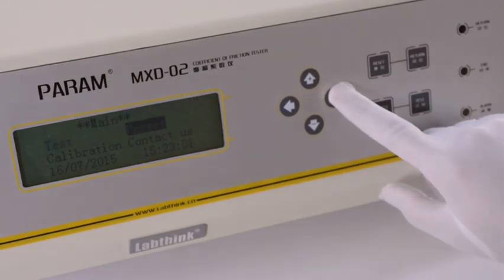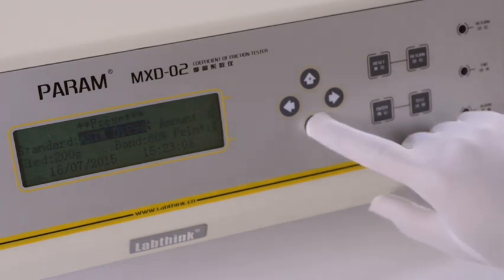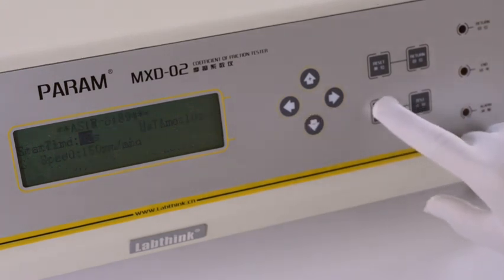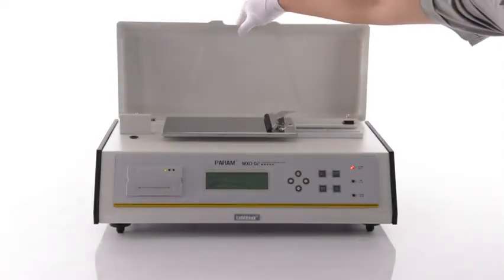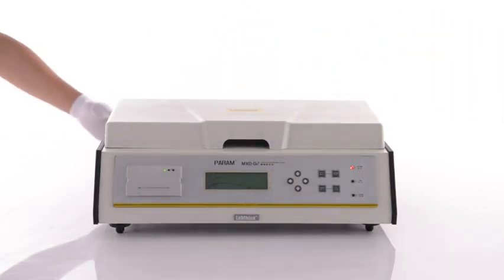Press Enter to enter the preset interface, and press the left and right arrow keys to move the cursor to standard, and select ASTM-D1894. The speed will be 150 mm per minute. Treatment after test. Pull down the dustproof cover. Switch off the instrument.